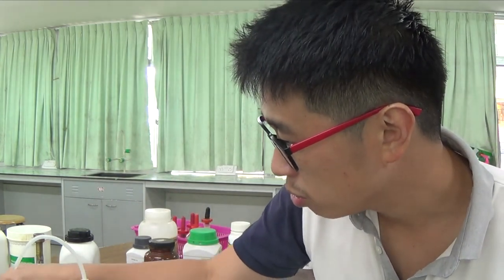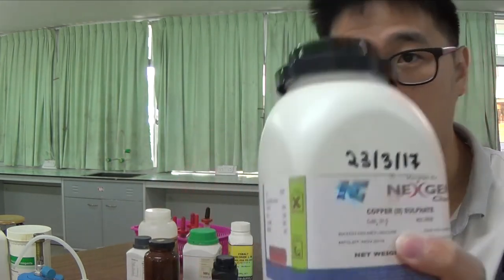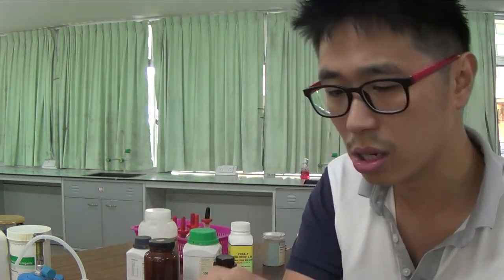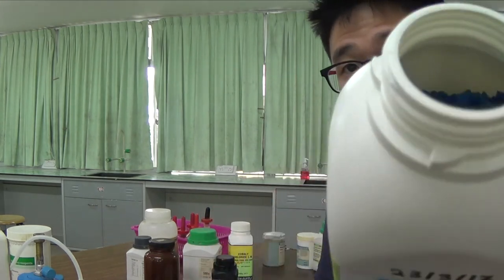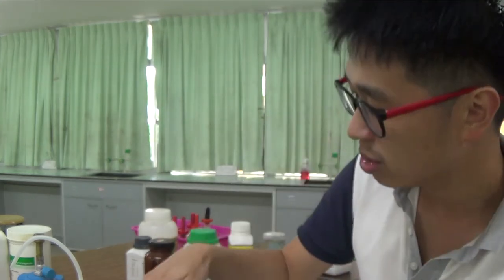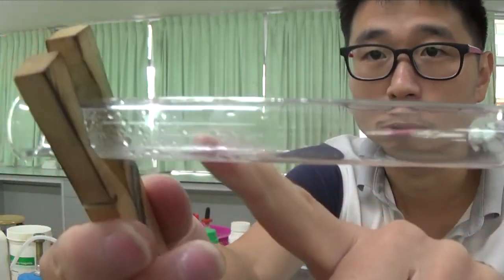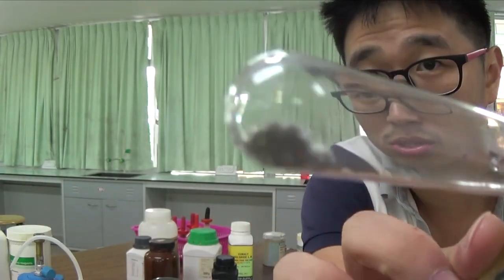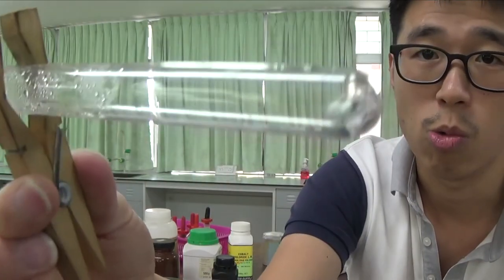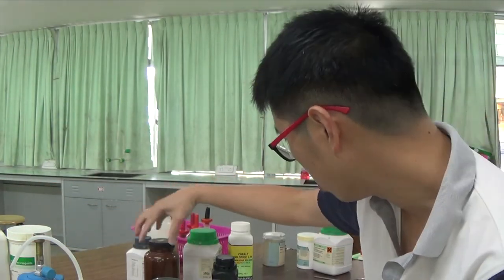There was a copper 2. This was the copper 2 that gives you the white colored solid, all right? So copper 2 sulfate hydrate. This was the hydrated salt that I heated just now. Remember, we started with very blue colored crystals. That was hydrated. In the absence of the water of crystallization, the upper part of the tube is just water. Because I heated very strongly, you don't see any blue colored solid at all. They are all white colored solid, because it's anhydrous.